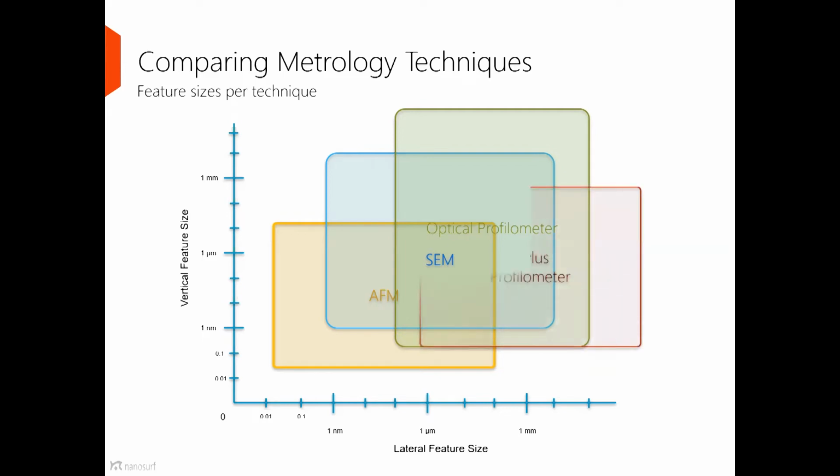And then our stylus profilometer, lastly, again, it kind of overlaps in this very high vertical resolution, but not quite as high fidelity in the lateral direction. But again, stylus profilometers, as they're typically making line traces, can measure things that end up being very long. So it's not uncommon to make a stylus trace that ends up being millimeters or potentially even centimeters long.